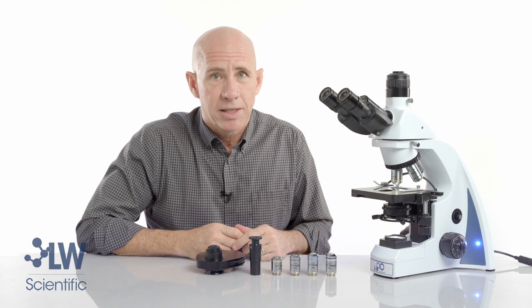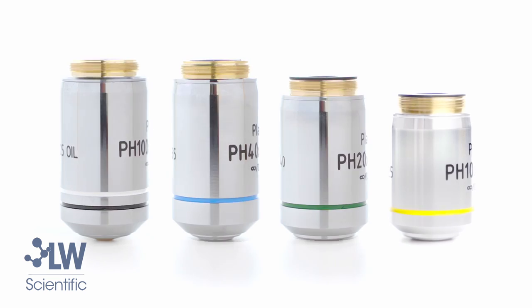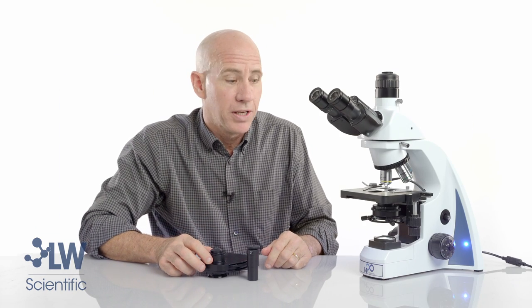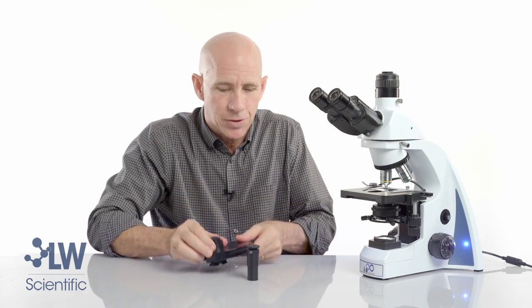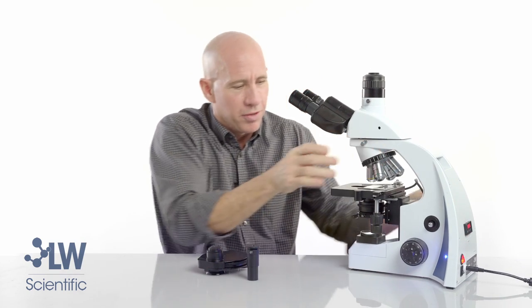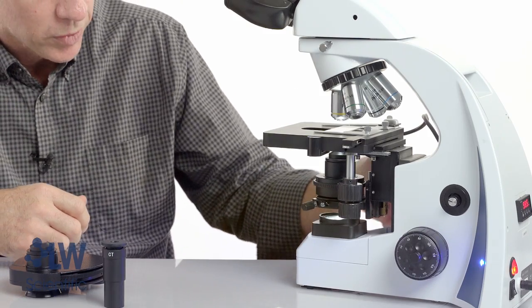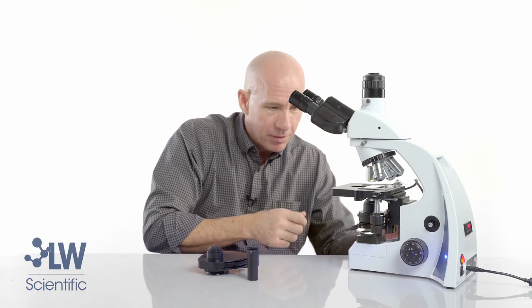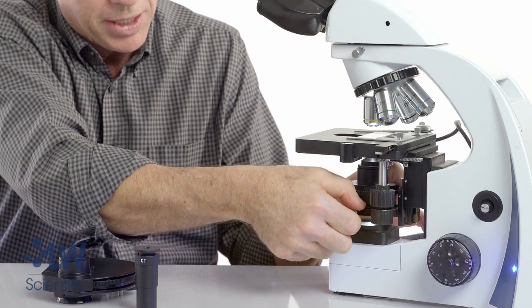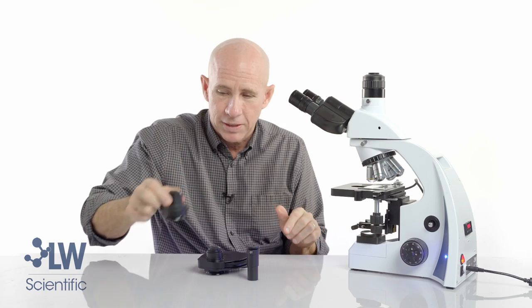Now let's talk about installation. The first step is to install your phase contrast objectives. After you've finished installing your objectives, next we'll install the phase contrast turret condenser. The first thing we need to do is lower the condenser holder. There's a wheel to the left that I can turn, and there's a silver thumb screw which I can loosen and slide out my bright field condenser.